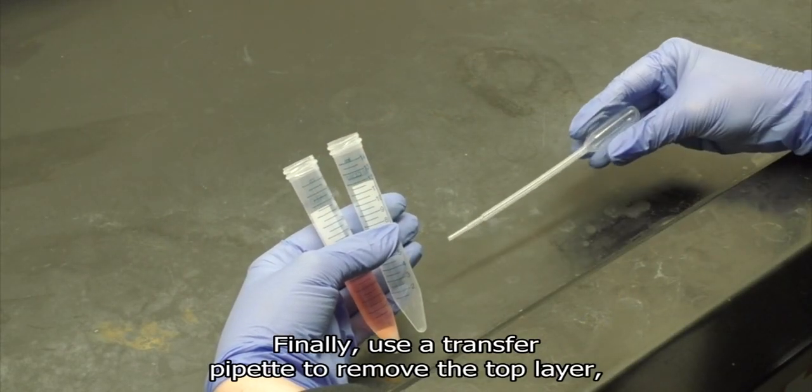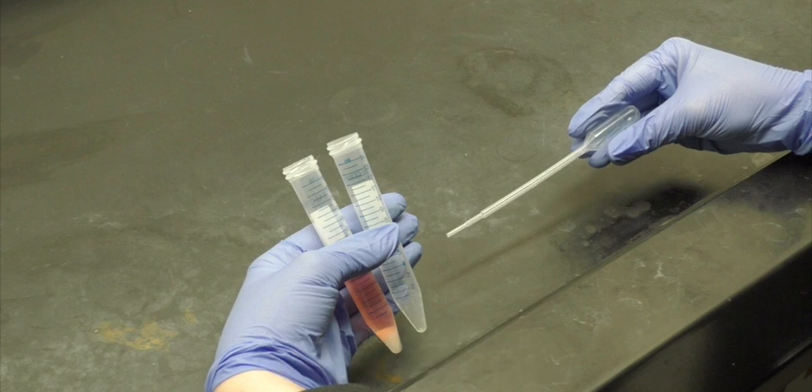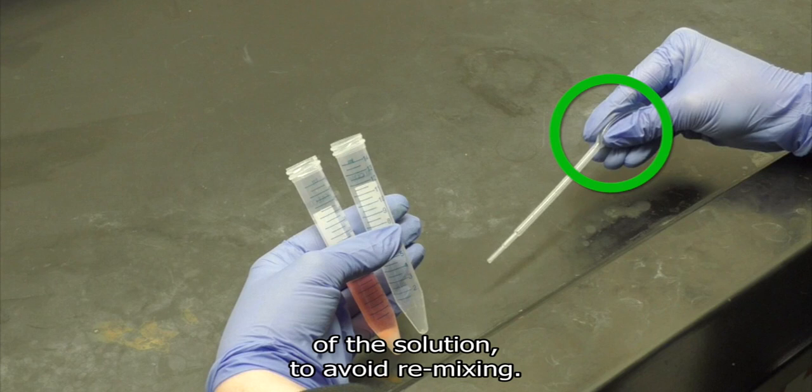Finally, use a transfer pipette to remove the top layer or supernatant from your centrifuge sample. Be sure to expel air from the pipette while it is outside of the solution to avoid remixing.